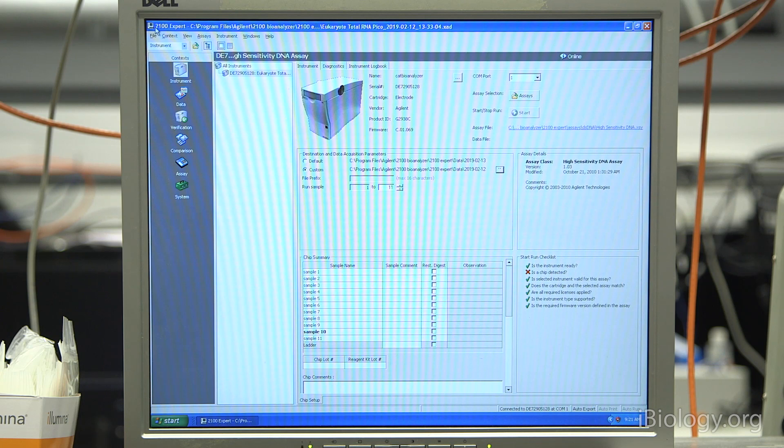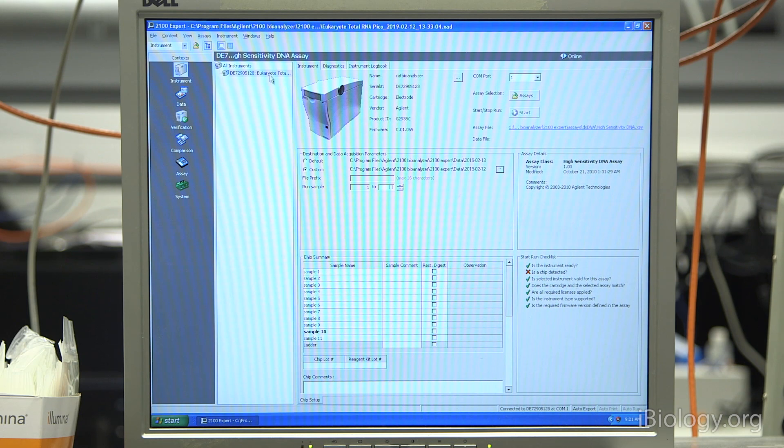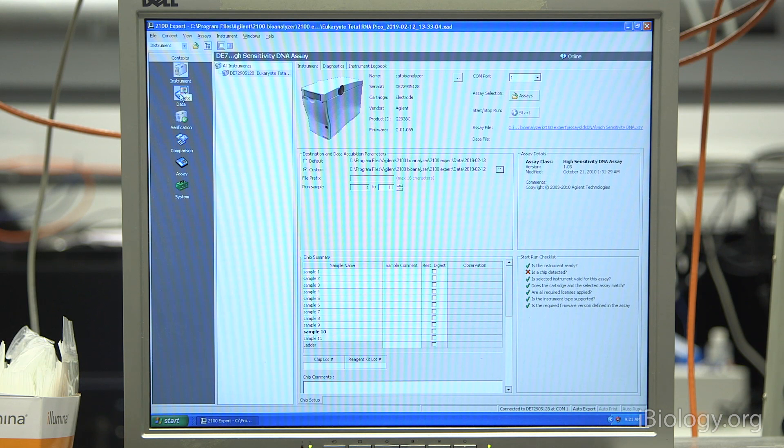The software that runs the Bioanalyzer is the 2100 Expert software. When you open up the software, it will automatically connect to the Bioanalyzer instrument. On the left are a set of icons that you can use to navigate to different areas of the software. To set up the run, you want to make sure you click on the instrument icon. On the instrument icon, again, you'll see a picture of the Bioanalyzer. And the first thing you want to do is select the assay that you're running.